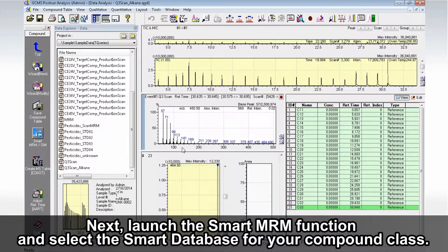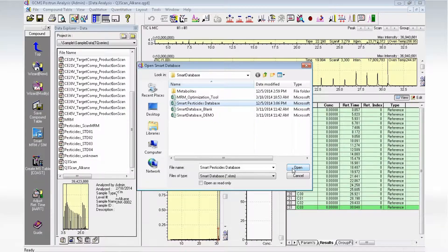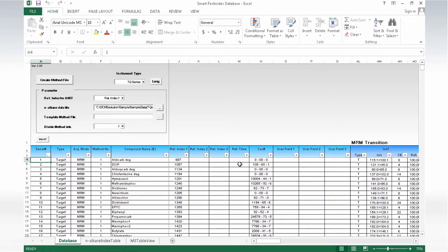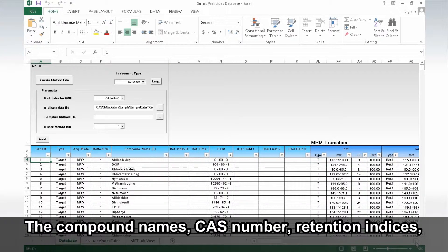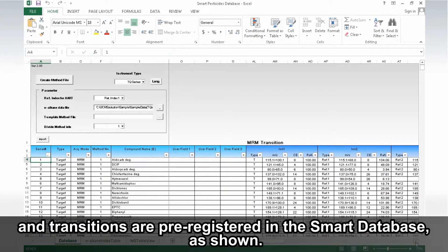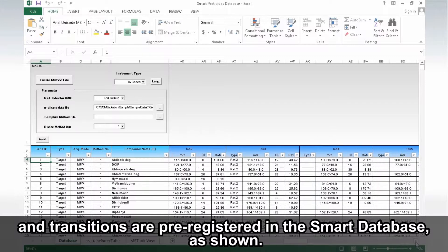Next, launch the Smart MRM function and select the Smart Database for your compound class. The compound names, CAS number, retention indices, and transitions are preregistered in the Smart Database as shown.